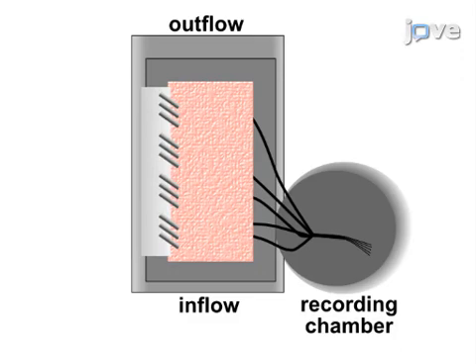In addition, responses to chemicals applied to the nerve endings can be tested by isolating the receptive field with a piece of brass tubing and replacing the solution with the solution containing the chemical or mixture of chemicals.